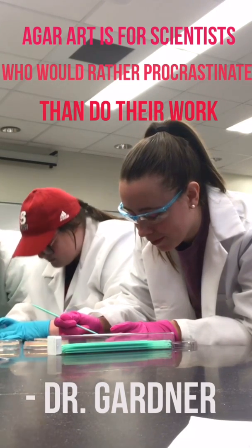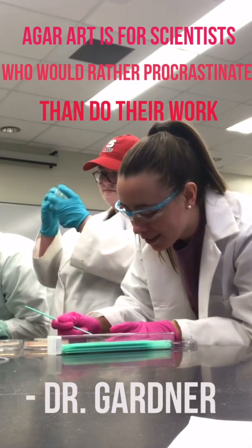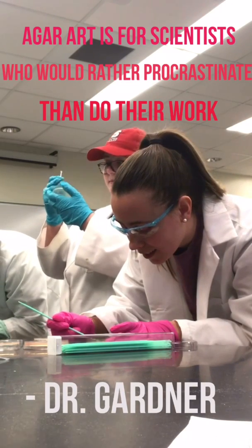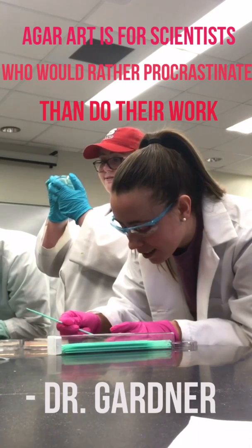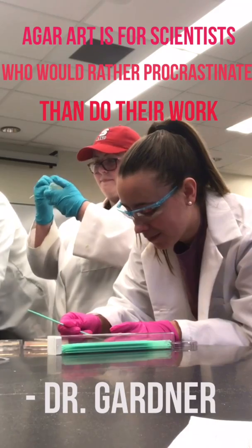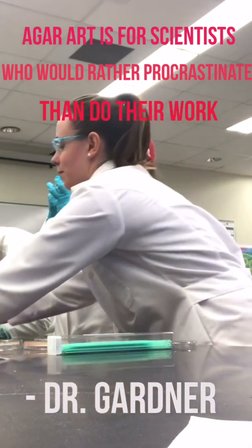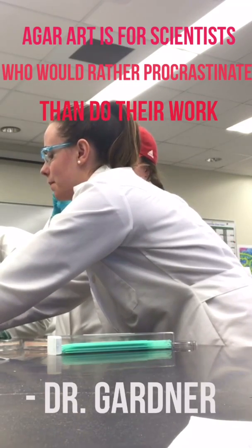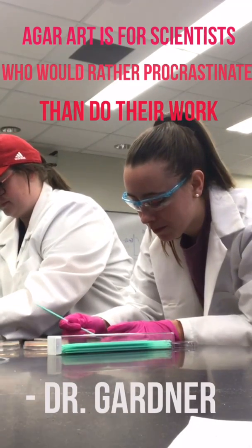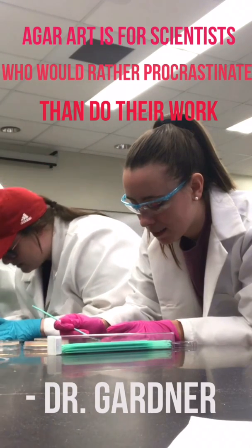Oh my gosh, this is an art. This is a skill set you have to have. Mine's gonna be so sloppy looking. This 8 is about to be so massive. I just keep making it bigger. Go big or go home. Ooh, I'm on the M. Okay, you got it. Oh, girl, it looks so good.